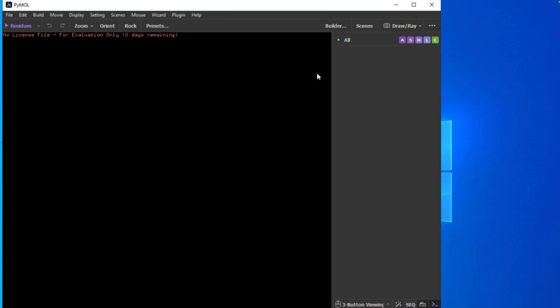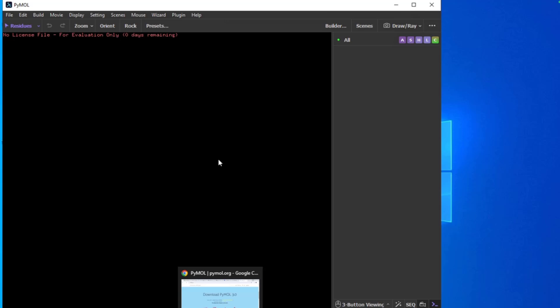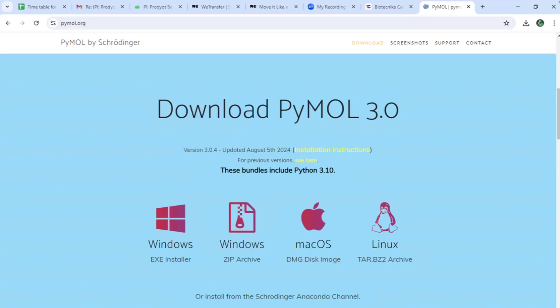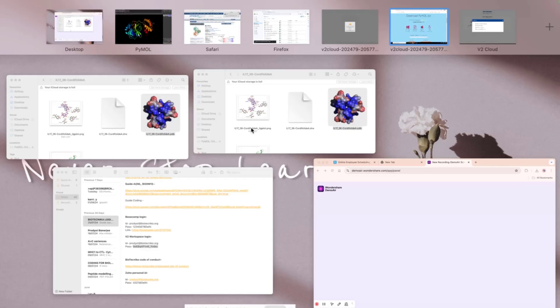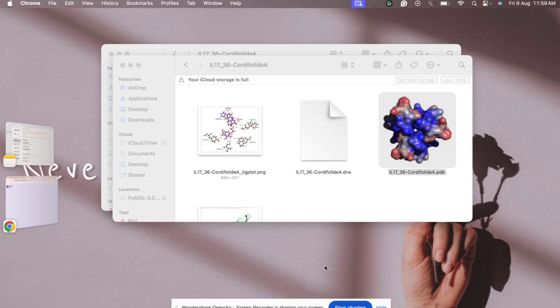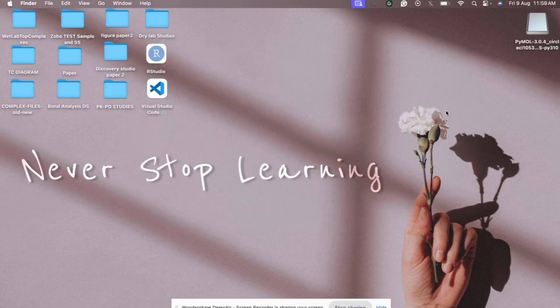PyMOL is not the only visualization tool — others include VMD and Chimera, and the installation process is similar for all of them: just go to your web browser, type in the tool name, and follow the same steps. That's all from my side for this demonstration. If you have any problems during installation, let me know in the comments. Thank you everyone.